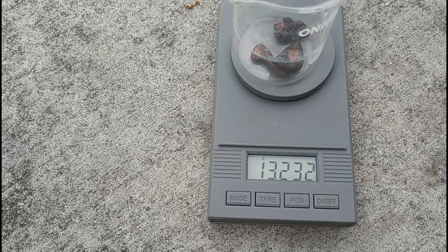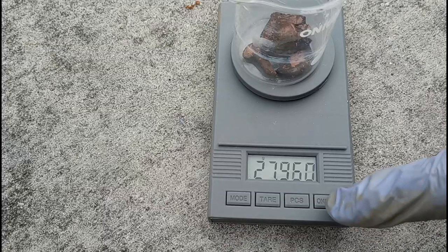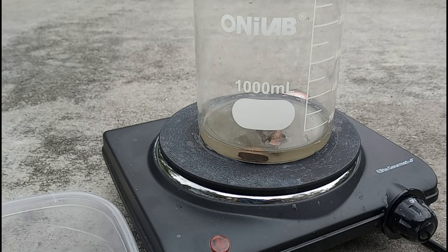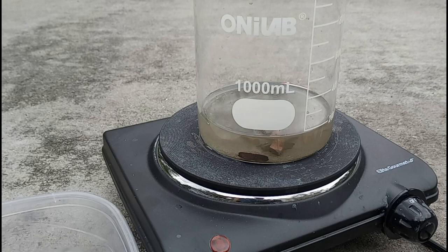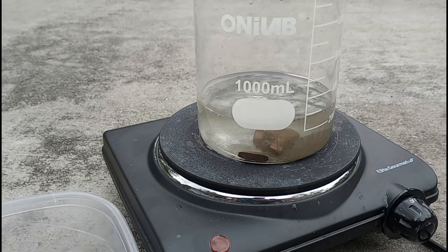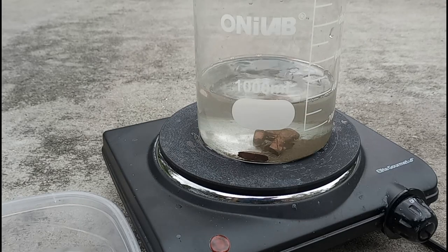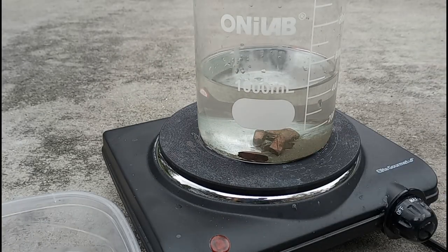We got 27.96 grams of big solid pieces left. We'll put the solid pieces back in the beaker and add 300 milliliters of vinegar and another 100 milliliters of hydrogen peroxide.